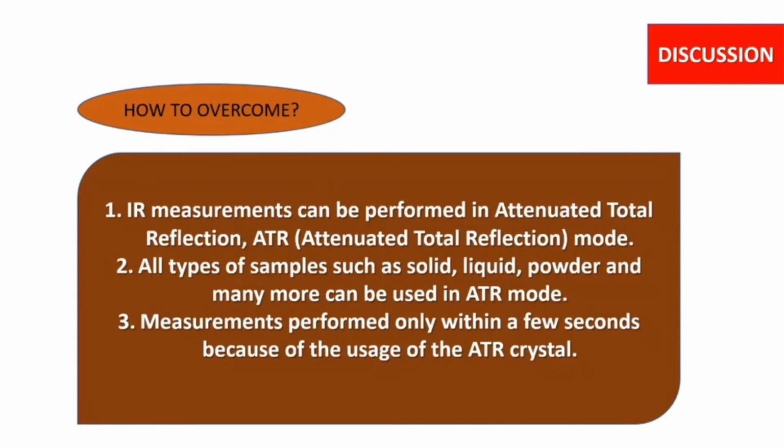How can we overcome the disadvantages of both methods, the KBr pellet and the reflectance method? To overcome the disadvantages of KBr pellets and liquid cells used in the reflectance method, nowadays IR measurements are mainly performed in ATR mode, where ATR stands for attenuated total reflection. This technique is simpler to use than the conventional transmission mode, which is the KBr pellets and the liquid cells.